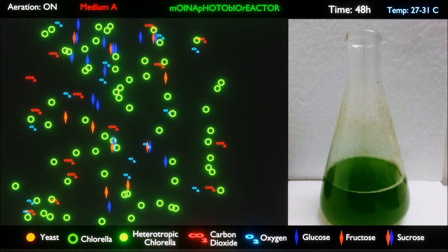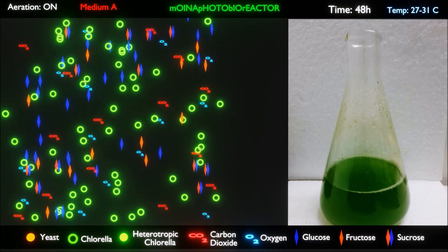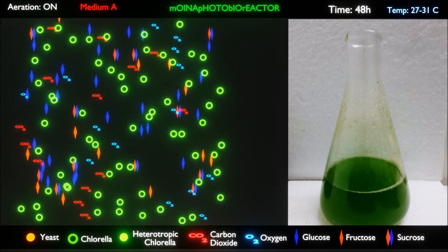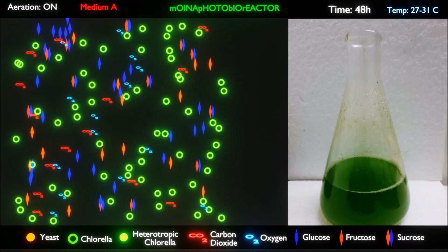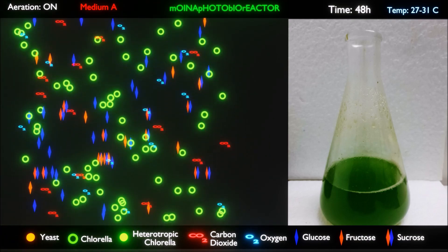At this stage, 1 milliliter of molasses is added per liter of aerated Chlorella algae culture and left to stand for the next 48 hours. The reason for this is that Chlorella does not instantly absorb glucose, and a time frame of 48 hours is normally required to observe the presence of fatty acids in the Chlorella.